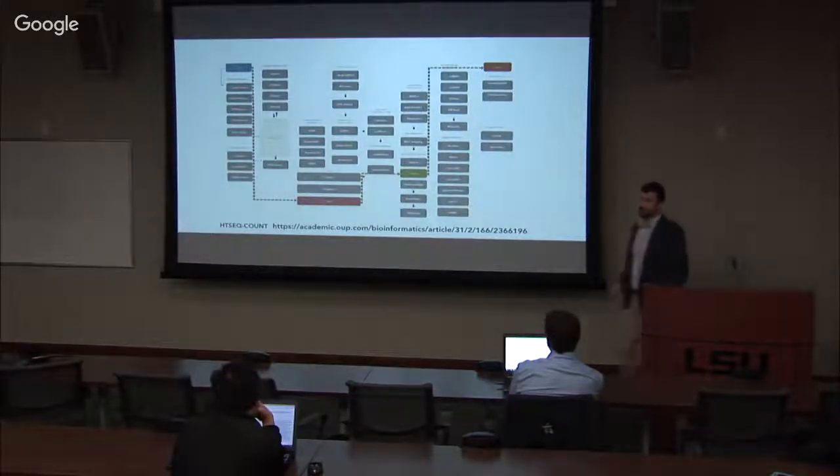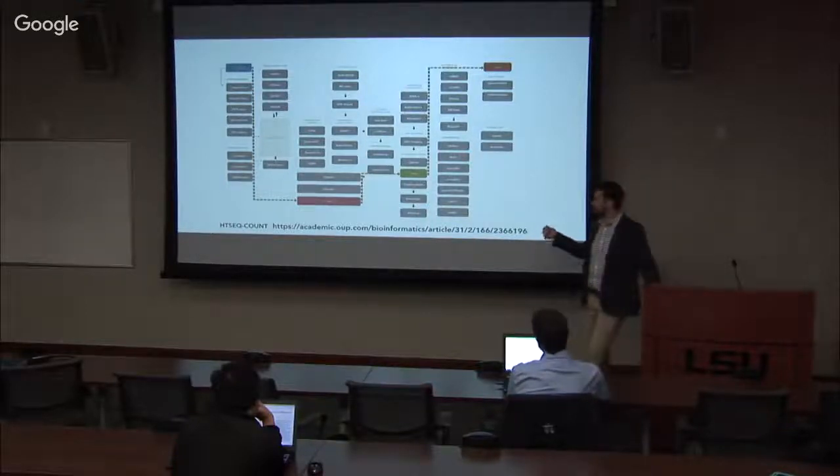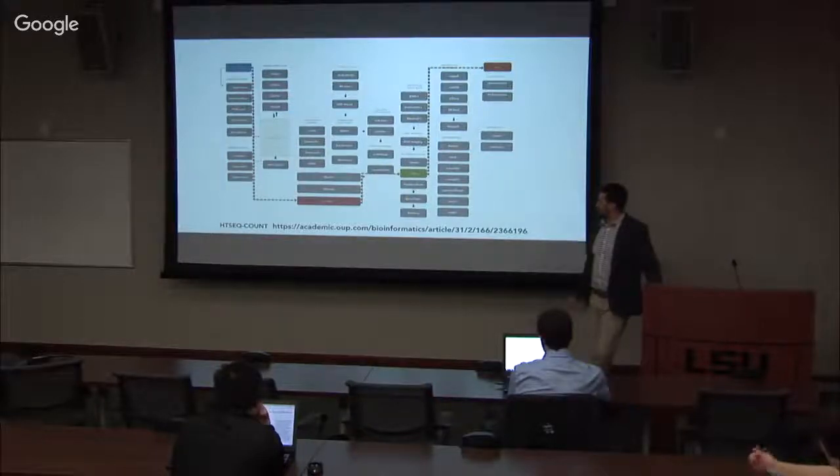And then you can also improve your quantification speed by using a similar approach. And here you have an example of HTSeq-count. And there's the publication on HTSeq.